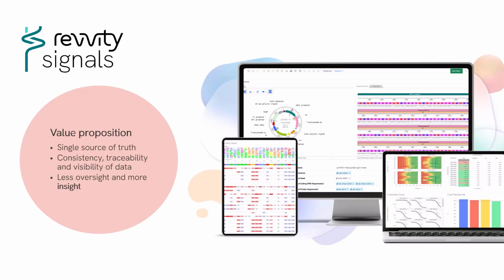So the value that you get out of having a Signals Notebook is that everybody in your organization makes decisions from a single source of truth. That allows you to have consistency, traceability, and visibility of all the data that is captured in the notebook. This allows less oversight and more insight into the research that you carry out in your organization.